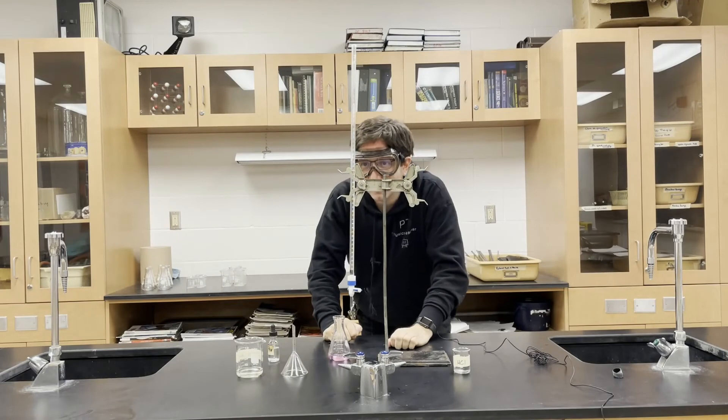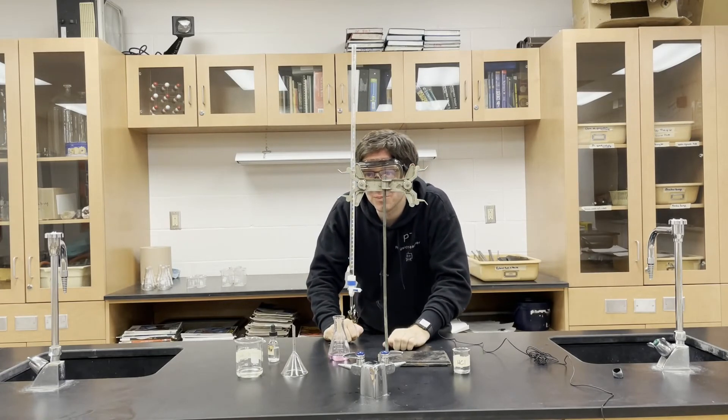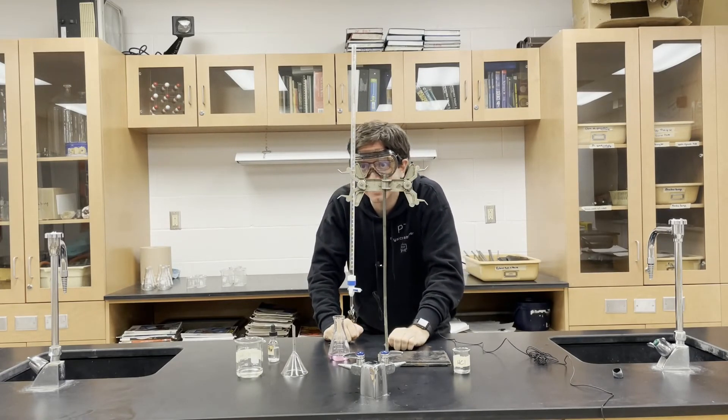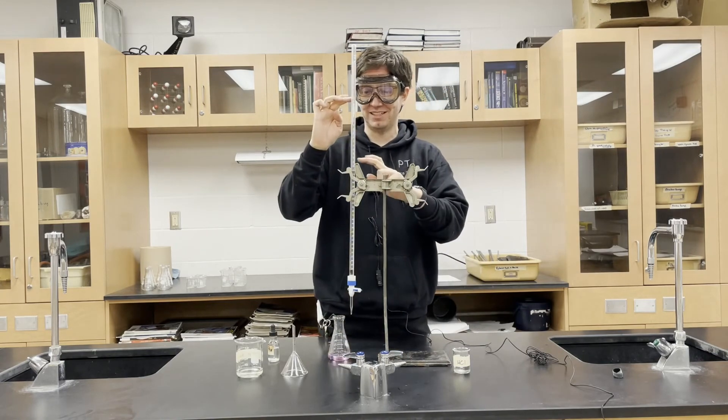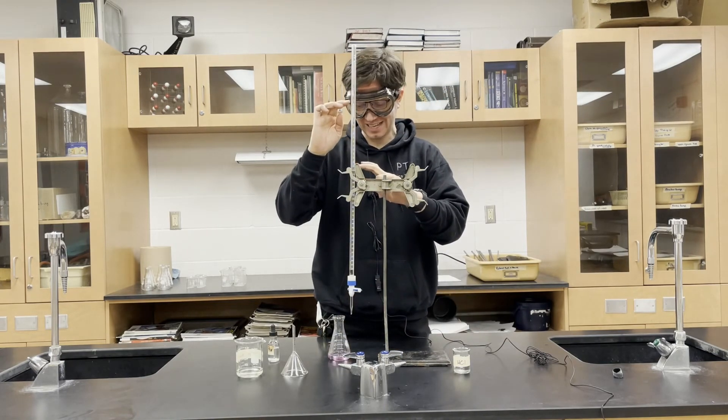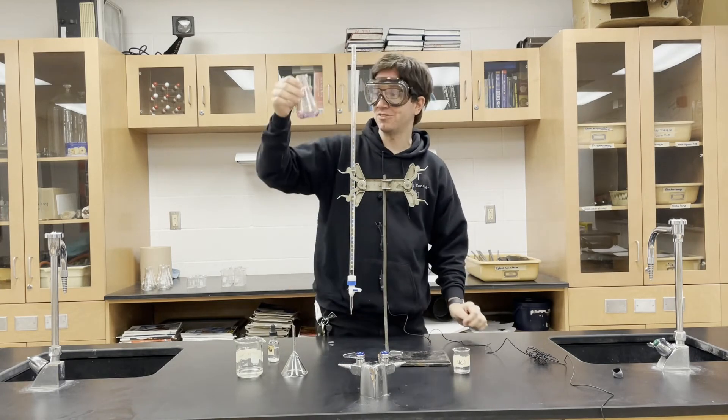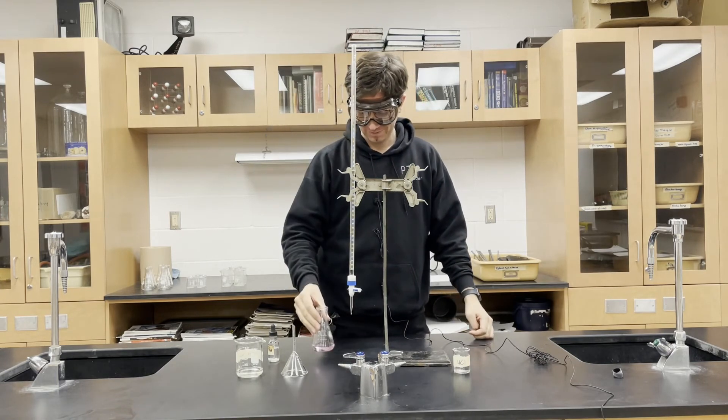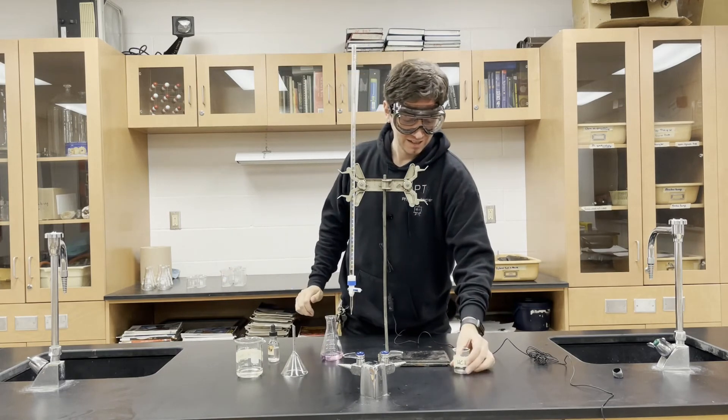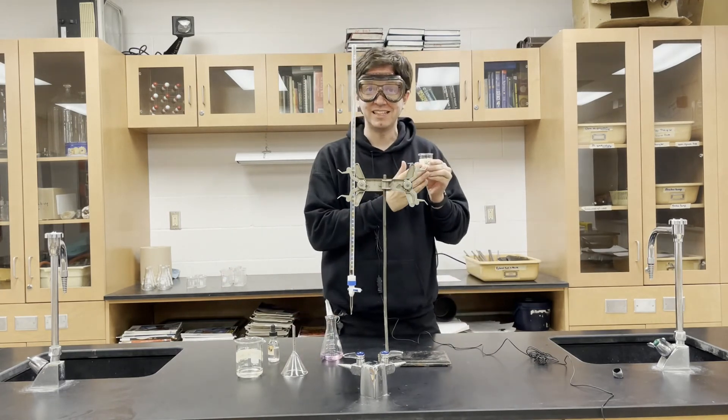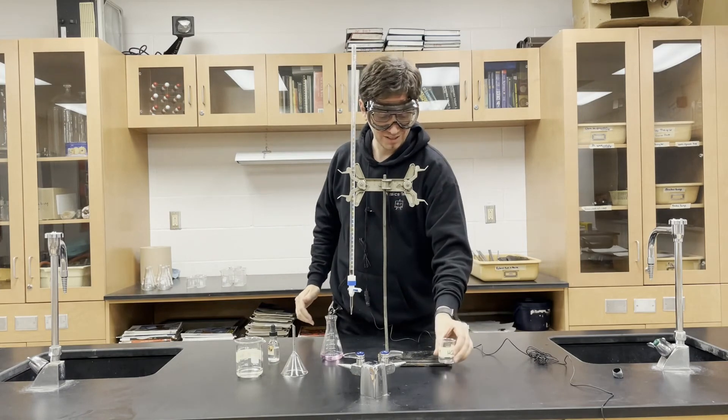We're going to check our final reading and it appears to be exactly 26 milliliters. So with that information, we can find the difference and figure out exactly how much sodium hydroxide we put in here. Knowing the volume and concentration of the sodium hydroxide and the volume of hydrochloric acid, you can figure out the concentration of the hydrochloric acid.